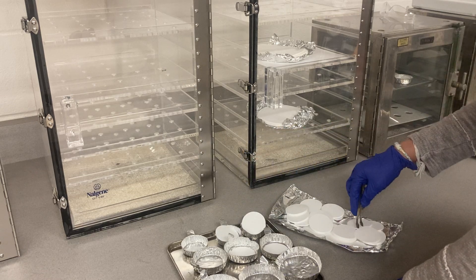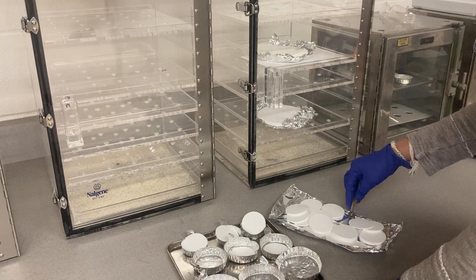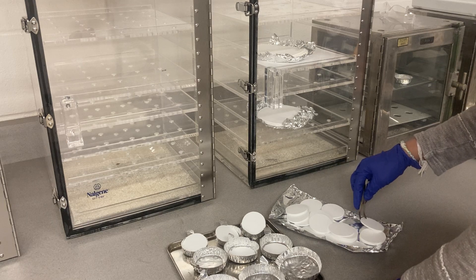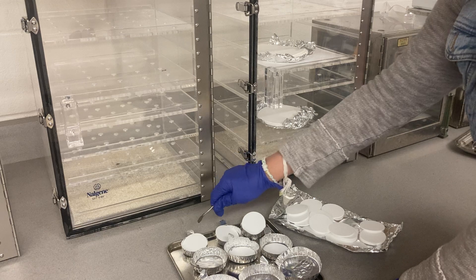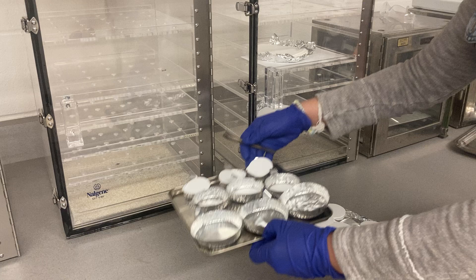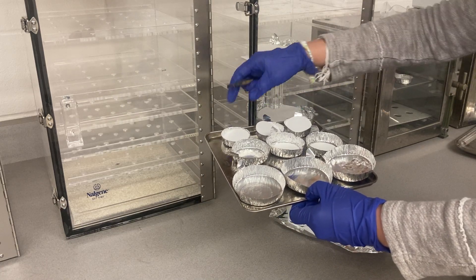Put one filter into each tray. And as I told you — if you remember the first step of total solids — you have to label everything. You cannot label anything on the filter itself, but you can mark on the aluminum tray.